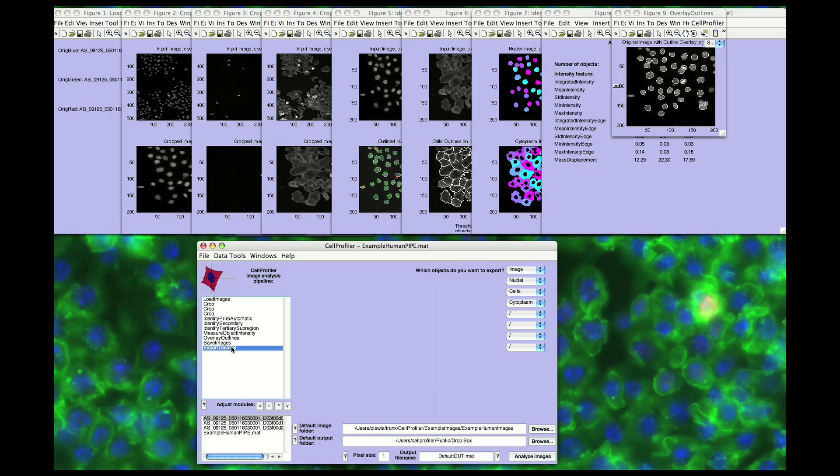This concludes our demo of the features of Cell Profiler. If you have any questions, you can always refer to the documentation or post on the online forum at cellprofiler.org.